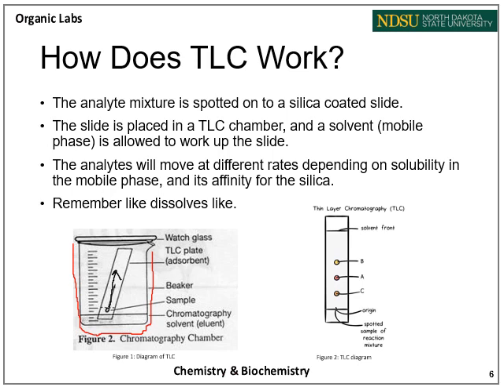Your finished TLC is going to look like what's shown on the right here. But one thing to keep in mind is that the number of spots you will have will differ. In this particular example, it shows 3, but sometimes you'll have 1, you'll have 2, you'll have 5. It all just depends on what your analyte is.